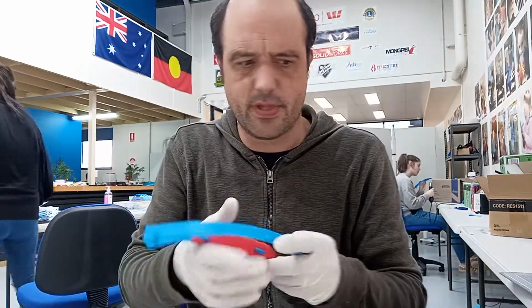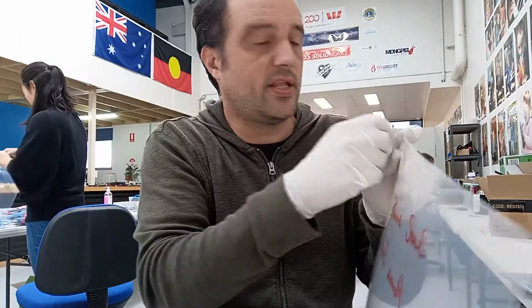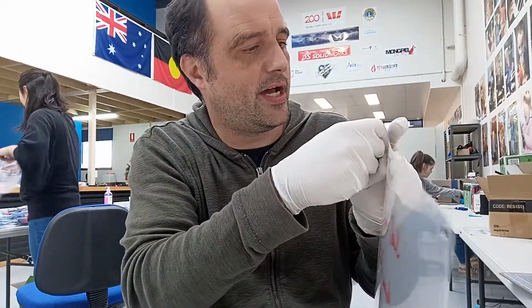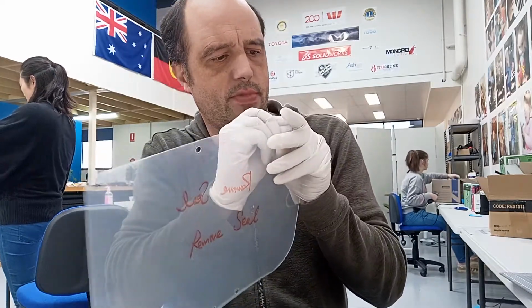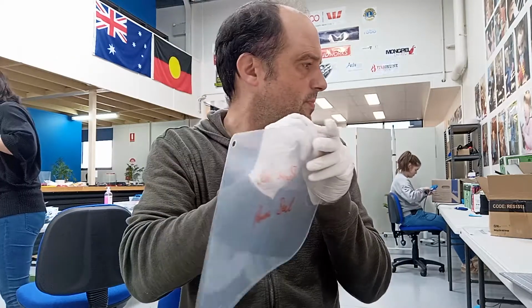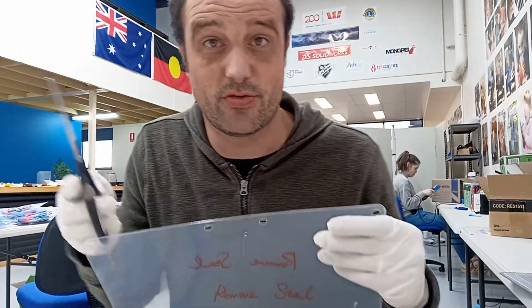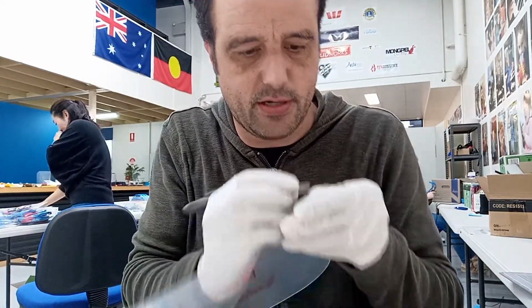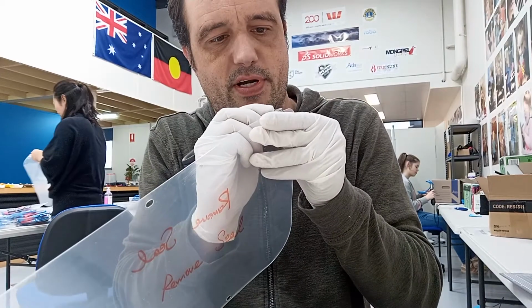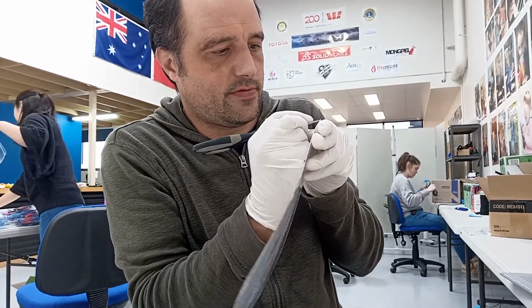The second step is to remove the seal. It can be a little bit tricky, especially if you're wearing gloves. Just comes off like a phone screen. You can use a sharp tool. Right, really difficult to remove with gloves on. But it just peels off, and once it starts to peel, comes off very easy. So you can just, maybe in one of the corners, you can scratch it off.